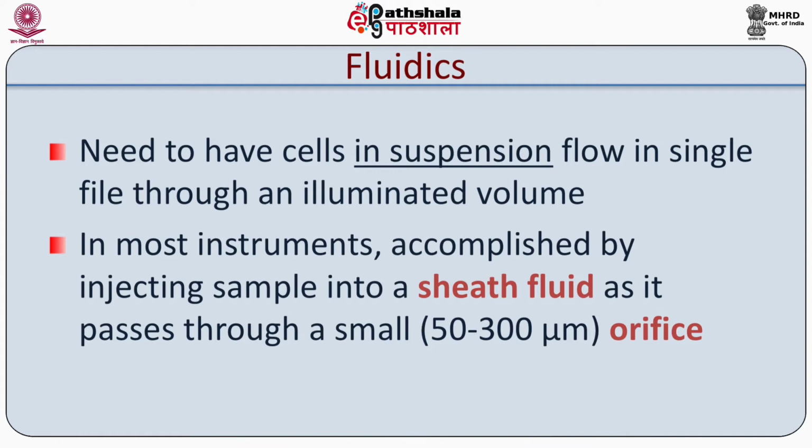So another important thing is that these single cells, as they pass through the beam of light, should be optimally illuminated, and so for that they should be in the center of the beam. And this is achieved by the design of the flow chamber in which the single cell suspension is injected. The sample is injected into a stream within the flow chamber.